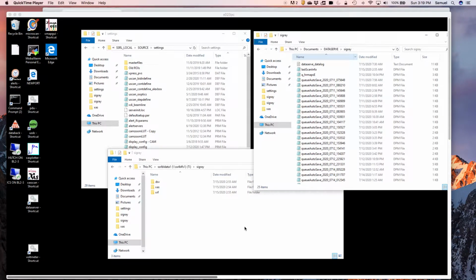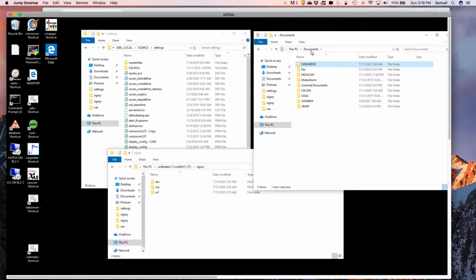In this video, I'm going to go over some of the data file formats that you find at the microprobe imaging beamlines at SSRL. I'm going to start by showing you the files that are in the My Documents section. Each of the major programs has their own set of documents here and files.